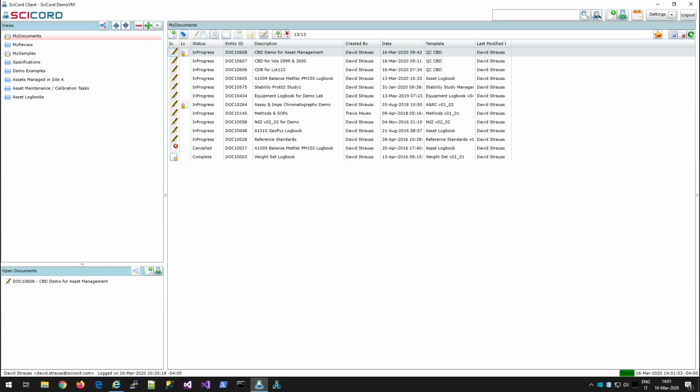SciCord ELN is focused on efficient and compliant scientific documentation. Comprehensive asset management is a cornerstone to increasing both efficiency and compliance. This video will demonstrate equipment and instrument management techniques suitable across the compliance spectrum, from development to manufacture.